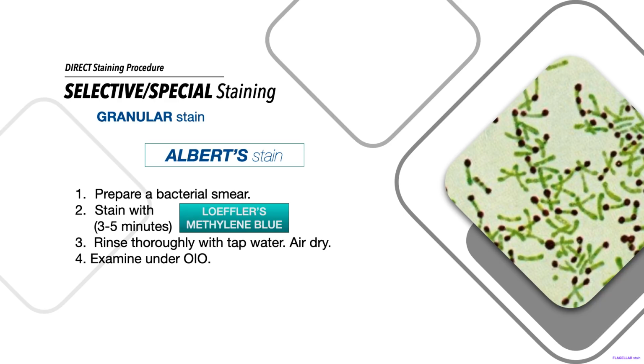Now, after this, guys, this is how you're gonna see your structure or your granules. They would appear brownish black, yung granules, while the cytoplasm and even the background would appear green or even up to light blue.